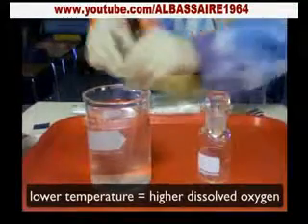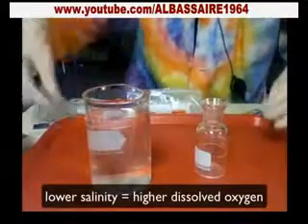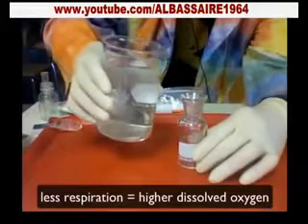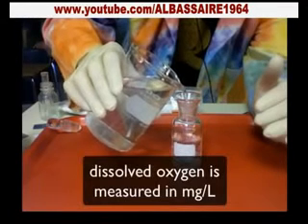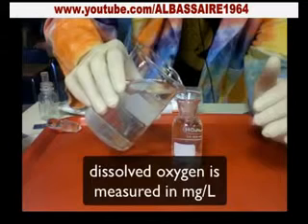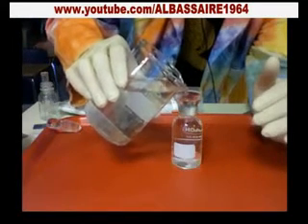And I'm going to get my bottle. I'm going to take the lid off. This is just water that I've taken right out of the stream. What we're measuring is the amount of dissolved oxygen, so I'm going to gradually pour this in. But if we have bubbles in it, that's going to screw up our result, because what we're really trying to measure is the dissolved oxygen, not those bubbles.